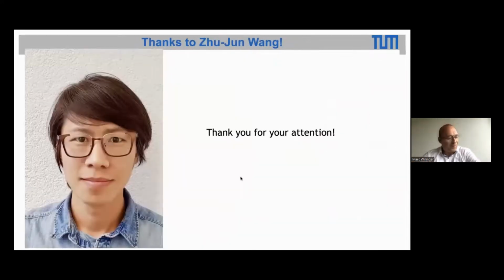I have finished my hour, and I just want to highlight. First of all, I want to thank Jun for his fantastic work. And secondly, I want to highlight that the SEM allows you to study processes, even as crazy as graphene that grows at 1000 degrees and gives you an atomic layer only. But you can observe it, you can watch it, and you can study it, and you can derive atomistic details about the process by observing as it happens. Even so, the microscope itself does not have atomic resolution. I think that's it.